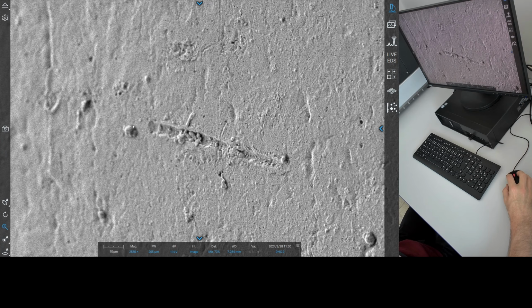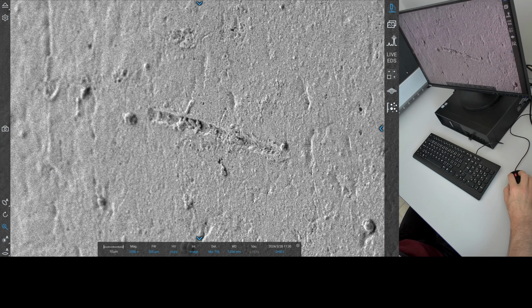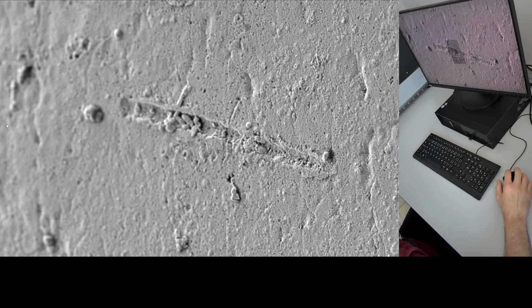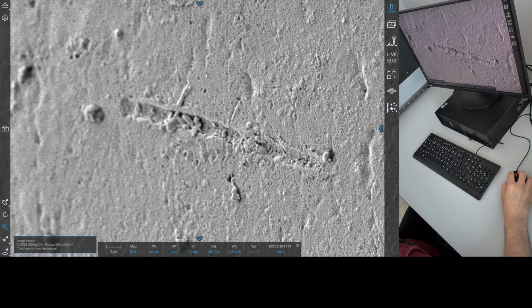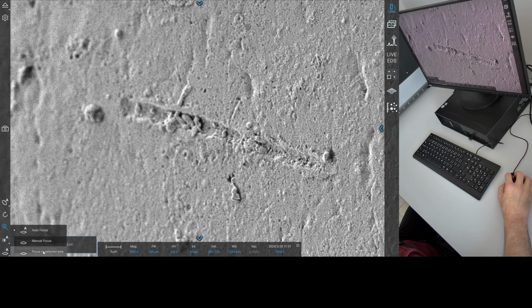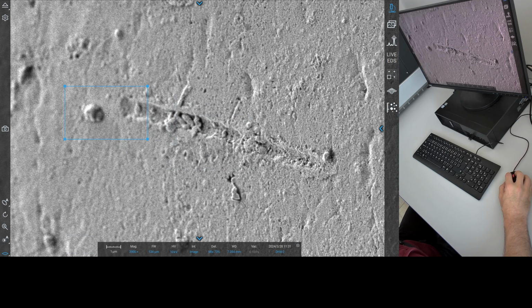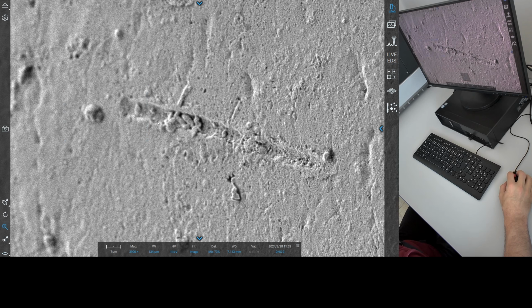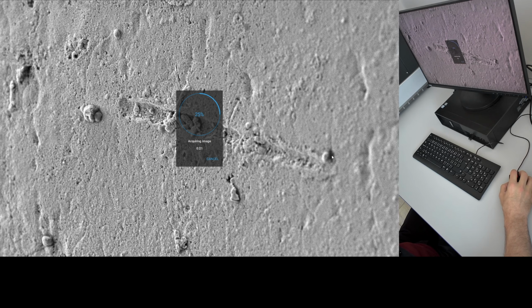Definitely cut a channel out of here. Incredible. Now, is this the dead end here or that end? Well, we'll change our focal plane back down to this one. Have a look at that first. Then we'll have a look at this end up here. I'll do a mid-focal plane as well. Actually, it might have already done that.